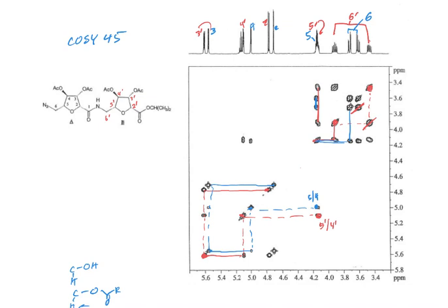Between 3 and 4, on the red lines that you pointed towards, it looks like two really close dots. Yeah, I think sometimes the close dots just go to some splitting here. Notice that this one is smaller, and I'm not quite sure.